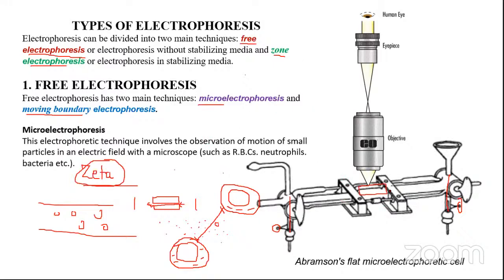So remember this for some point of time. This is just the first ever way in which electrophoresis was carried out. And at that time, because you were actually tracking the movement of charged entities between two points within the cell, that was referred to as microelectrophoresis because you are actually visualizing it under a microscope. So that was the concept of microelectrophoresis for you.